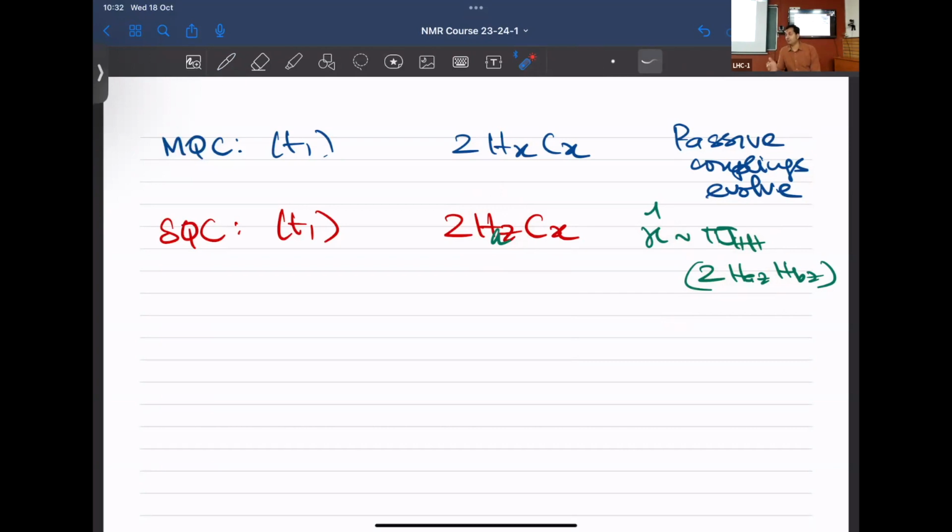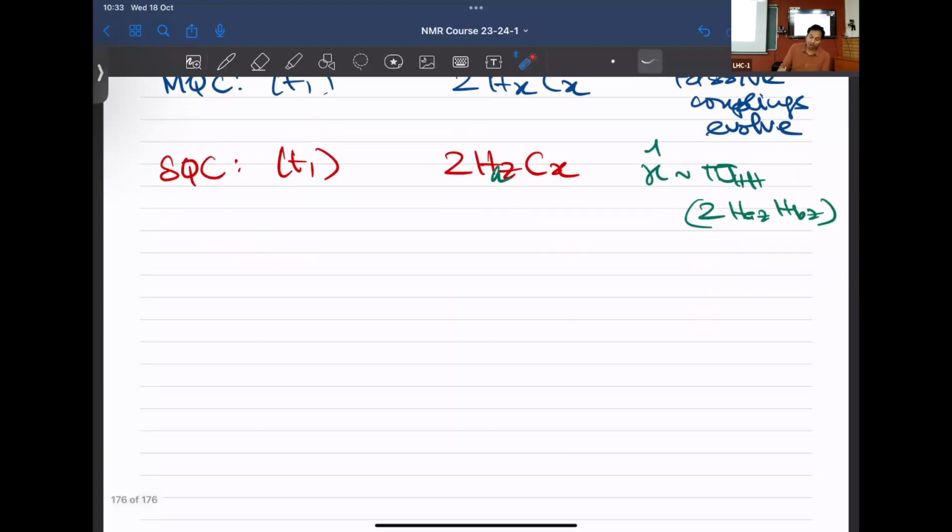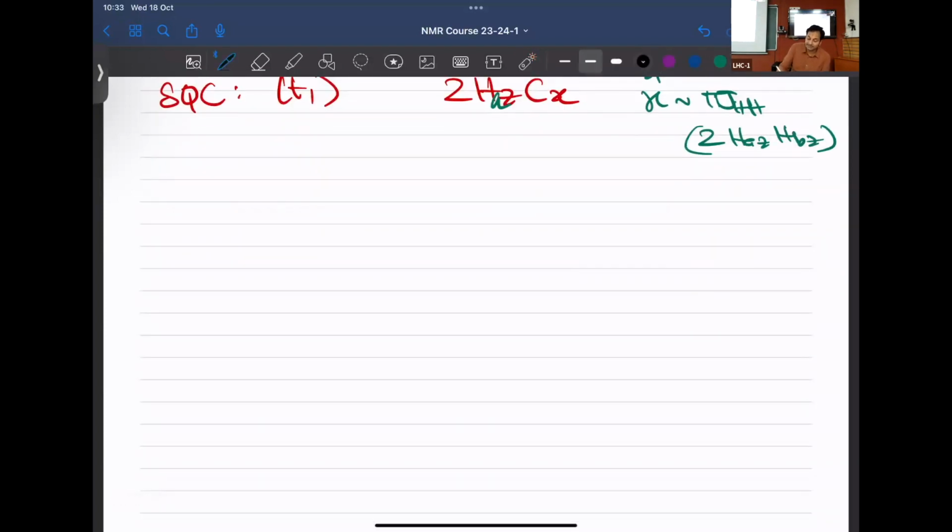An obvious progression for the heteronuclear experiment starting from the HMQC is the HSQC, which is the spectrum that I showed you last week on how an HSQC looks for BPTI, ubiquitin, and all the other proteins. A commonly run experiment is the HSQC, not the HMQC. There are advantages for the HMQC, but we'll keep that aside. So let's try to draw a pulse program for HSQC. I request everybody to pay attention here, because once you understand how to do this, it'll be much easier for you guys to do.